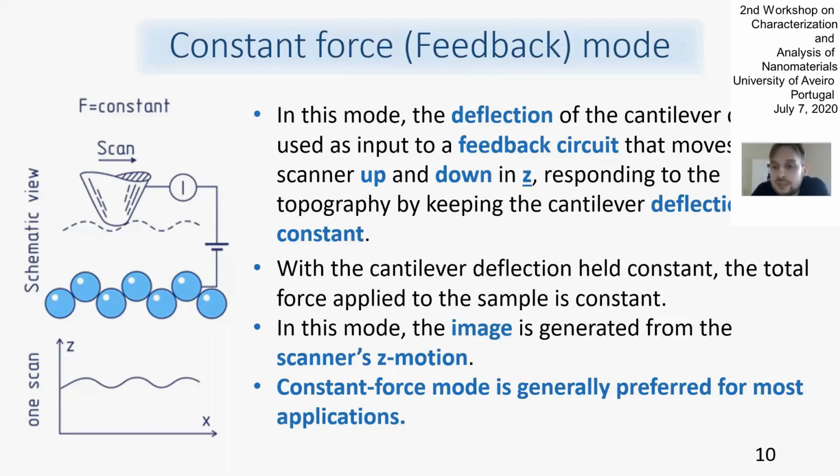And for most applications, the regime of constant force is preferred because it's less damaging, and you can save both the tip and the sample from too much interaction with high force.